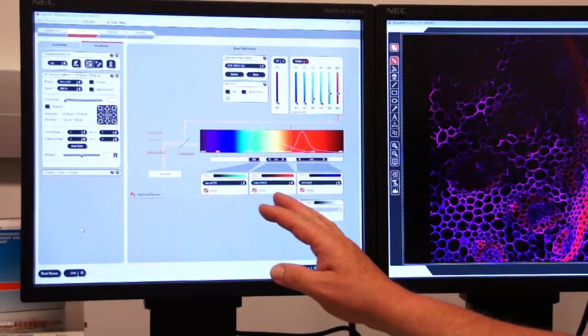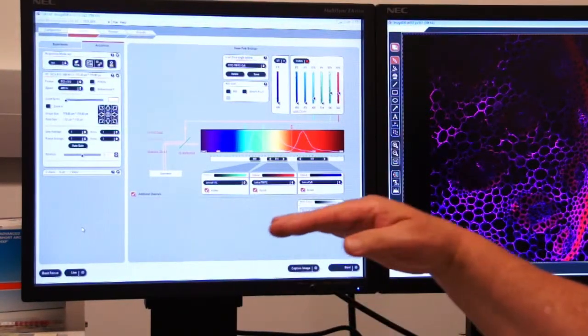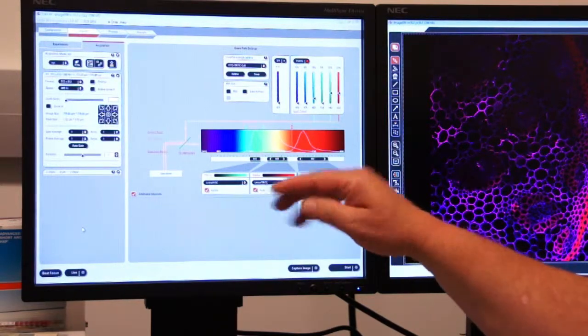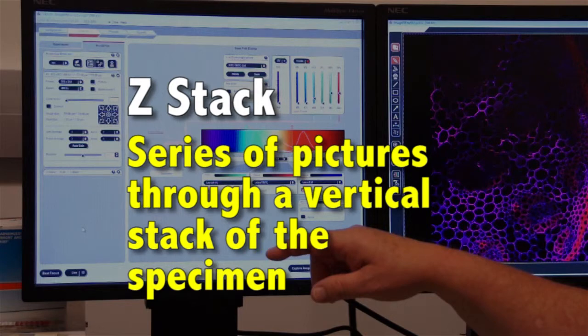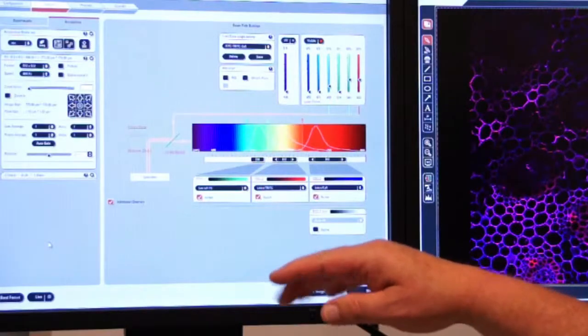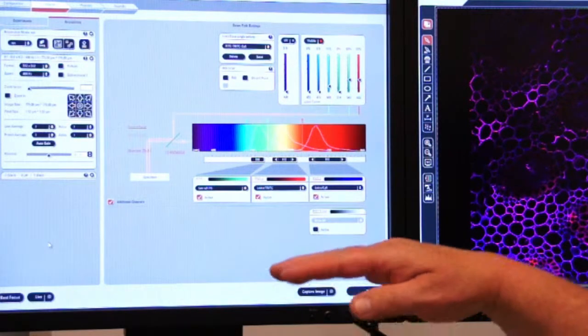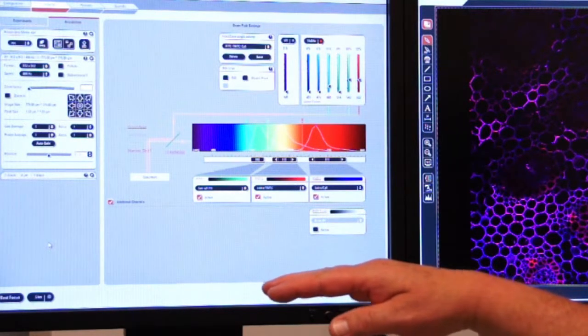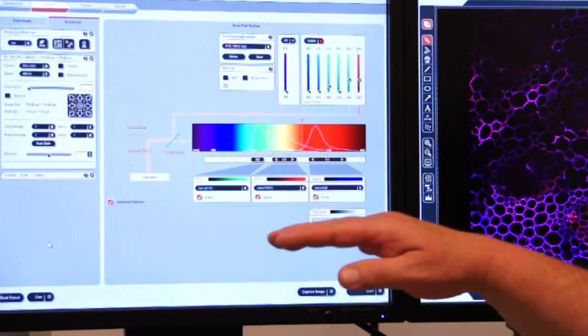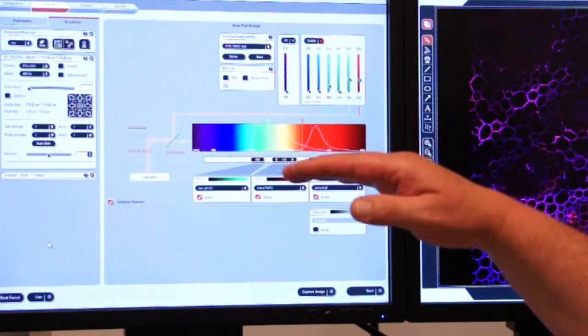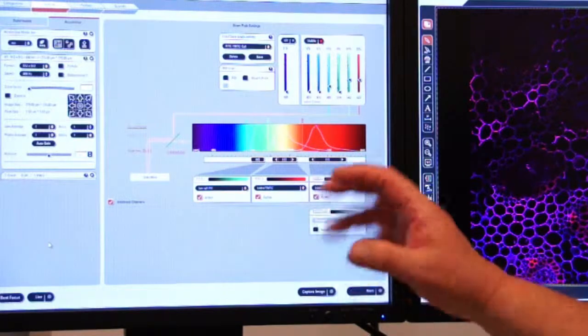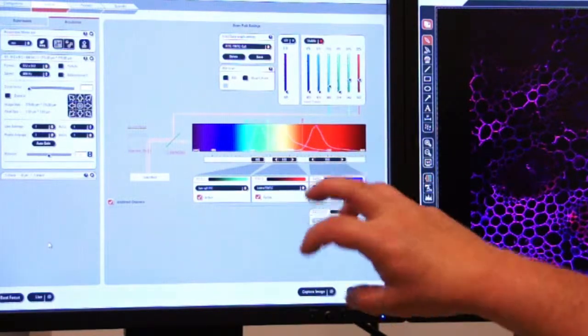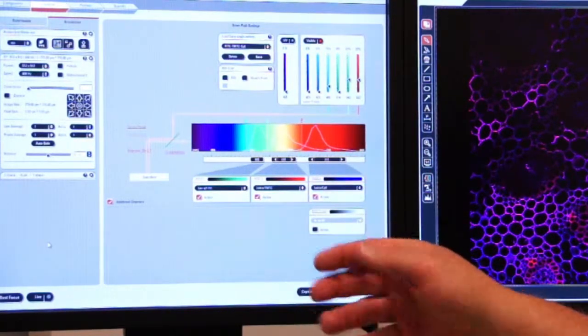Now, we will cover what is called a Z-Stack. We're going to take a series of pictures through a vertical stack of our tissue. So we're going to focus on one level, tell the system to begin capturing images. It's going to capture images all the way through that Z-Stack, and then we'll have a complete set of images that we can then turn into a 3D image to manipulate, or we can turn it into a movie.